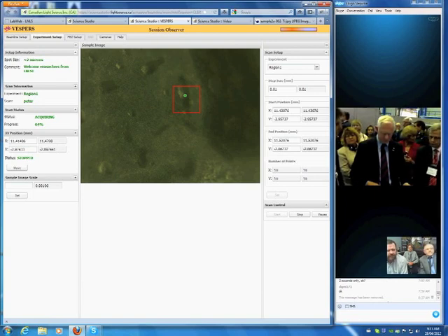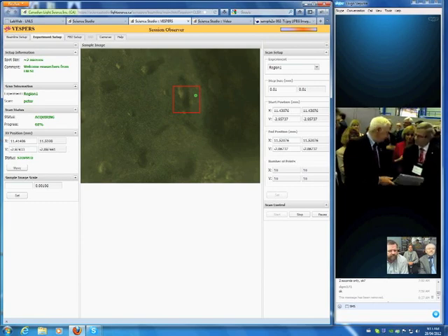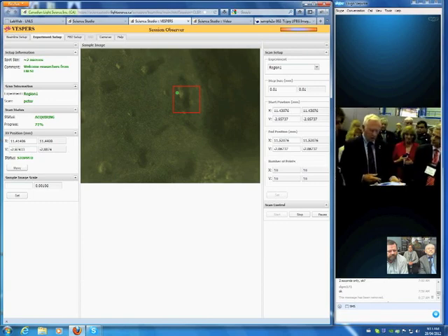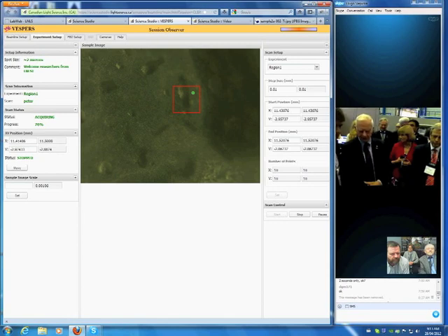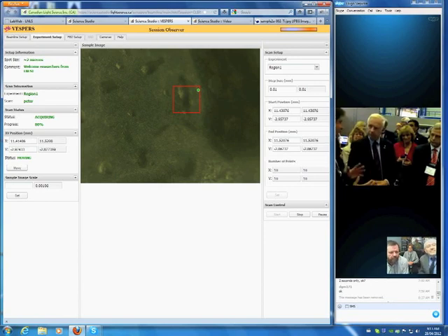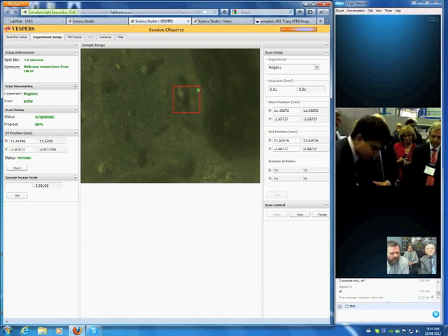In this full scan, when you see the peaks is where you have more in the tissue. It's very interesting. On what technology is this an advance? How do we measure Crohn's disease at the present time? We take a tissue sample and put it under a microscope, and it doesn't give you enough specificity. Yeah, as in any kind of biological study, you have all possible answers for the question. So this is one possibility. Am I right, Emil? What other kinds of diagnostics can you have for Crohn's disease besides the microfluorescence?